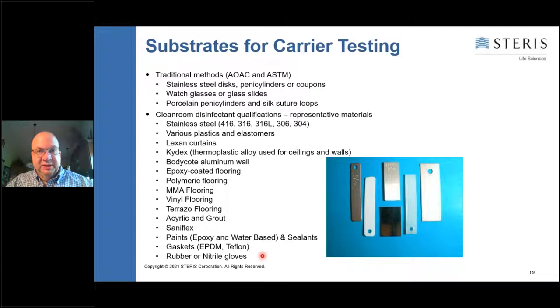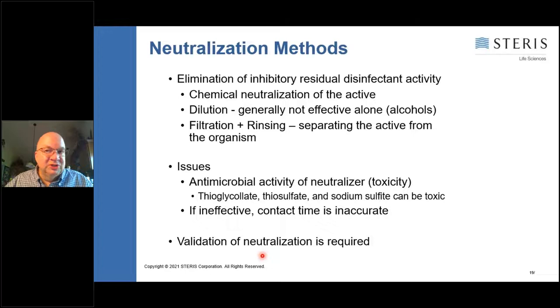Neutralization is a key thing to keep in mind. You have to quench the reaction and you have to neutralize that antimicrobial active, so the phenol or the quat molecule, to stop it from acting. So typically we recommend to neutralize the active component. You can neutralize alcohols with the 1:100 dilution with water, so neutralize IPA or ethanol. Another effective way is to do filtration with rinsing to separate the active from the organism.